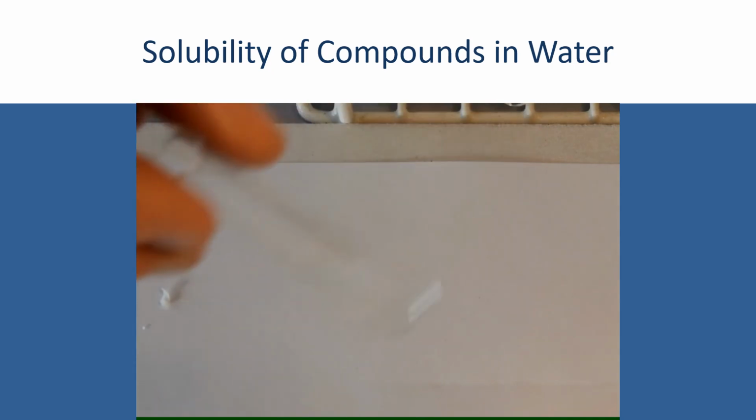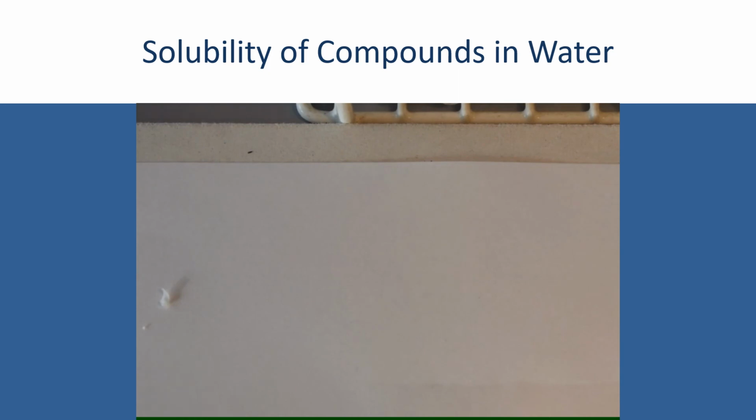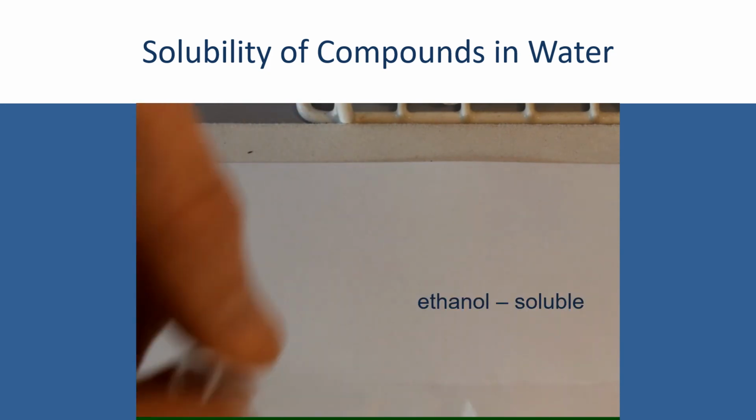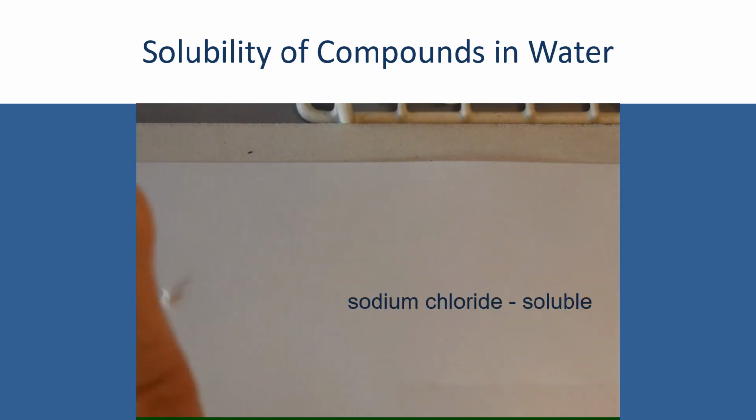The propanone has dissolved. The ethanol has dissolved in water. And finally, the sodium chloride has also fully dissolved in the water.